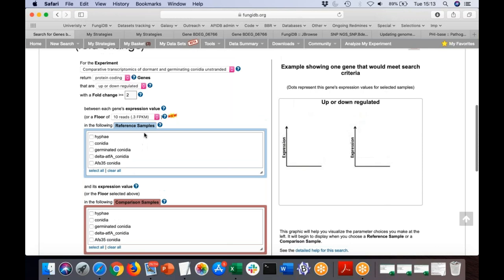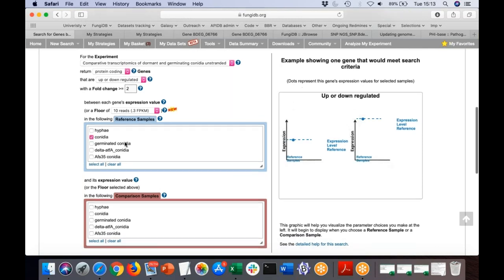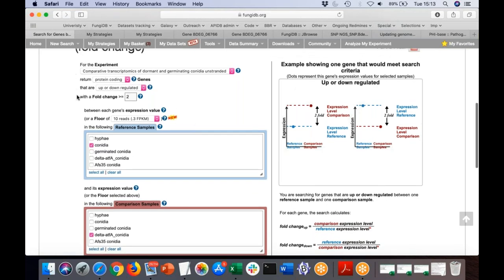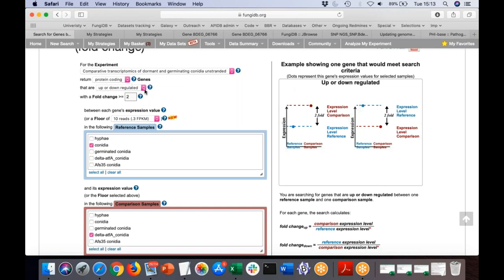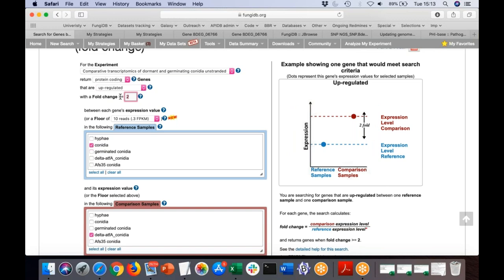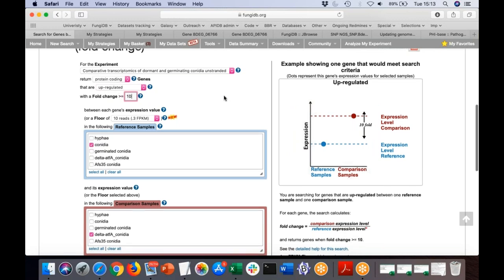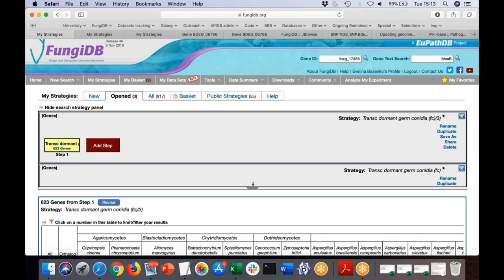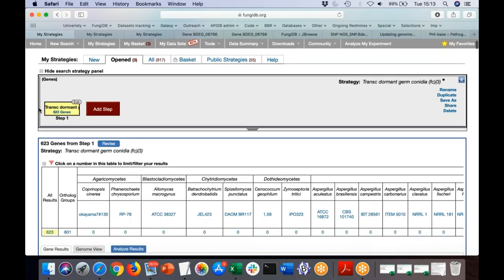Let's set up our search. For the reference sample I'll use conidia unaltered, and for the comparison sample I'll use delta ATFA mutants. I want to look at protein coding genes with significantly upregulated expression — for demonstration, at least tenfold upregulation. I'll click Answer, and after a few moments a step is highlighted in yellow showing 623 genes with tenfold upregulation in the mutant.